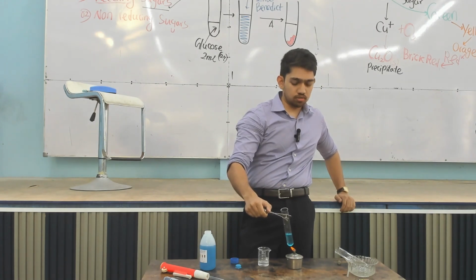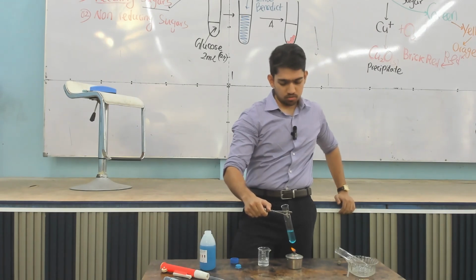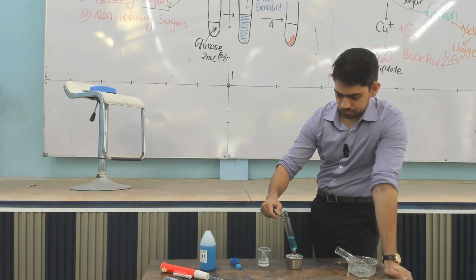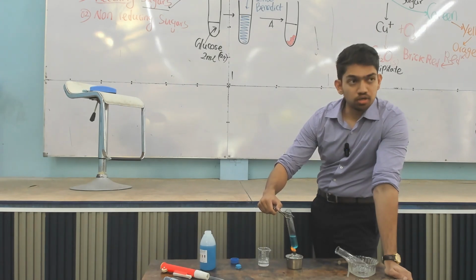So why do they say to use a water bath? To give heat evenly, and also sometimes there's a risk of the boiling tube bursting, shattering because of the heat. But this is a borosilicate one, so hopefully it won't. Because of the AC, the flame is... you have to heat it until it boils.